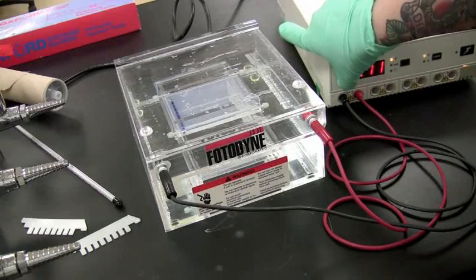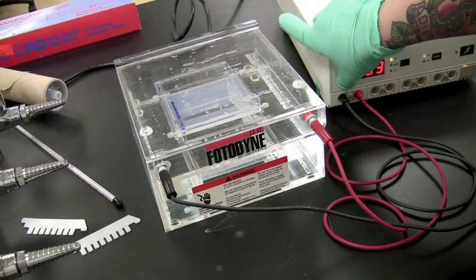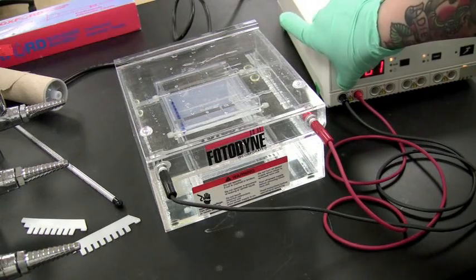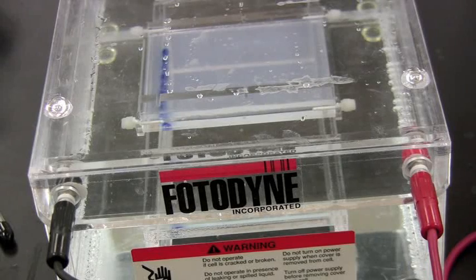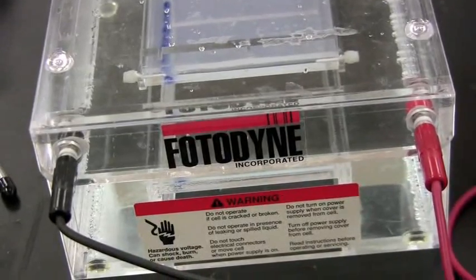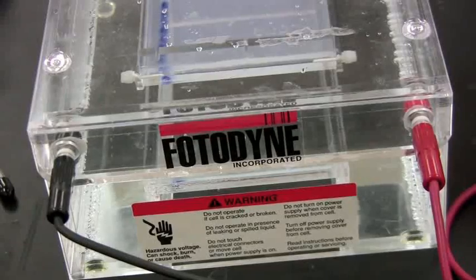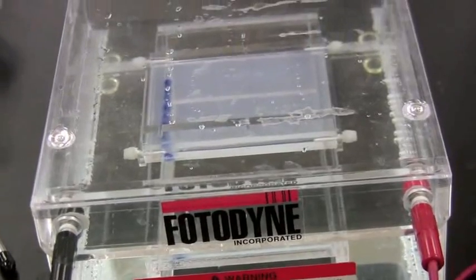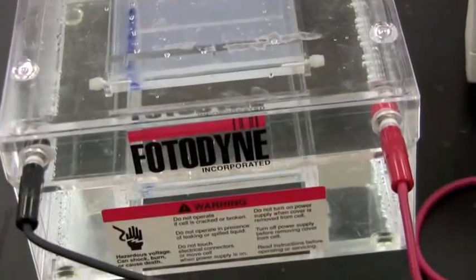The DNA-filled wells are on the black side since DNA is negatively charged, and the negative charge will repel it down the gel. This is an effective way of identifying DNA fragments from 0.5 to 25 kilobase pairs. Even when DNA is large compared to the gel pores, the rate of migration depends solely on the DNA, since linear DNA will snake through those pores. The smaller the number of base pairs a fragment is, the faster it will travel and the farther down the gel it will appear.